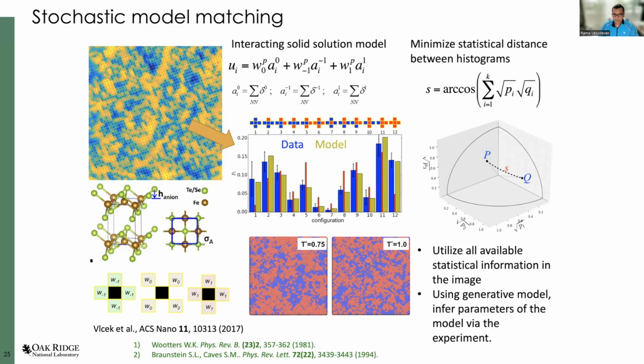And so that's really the power of this particular way, right? So we came up with a method where we could take an individual atomically resolved image, and compute what the atomic neighborhoods were. Then we can use that in a particularly sound statistical distance framework to match the theory with simulations and find the right interaction parameters, and also compare these interaction parameters with something that you might get from some kind of first principles approach.